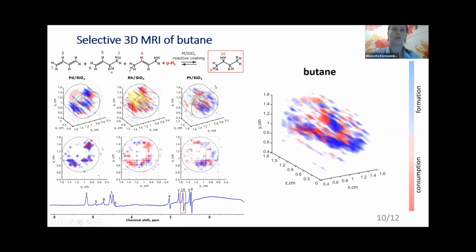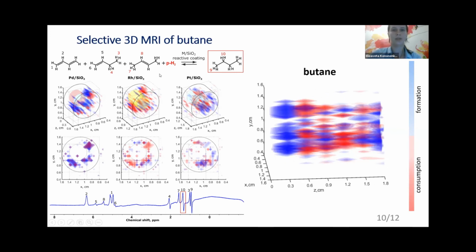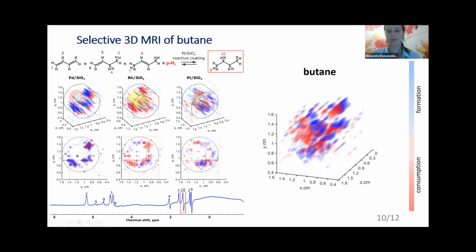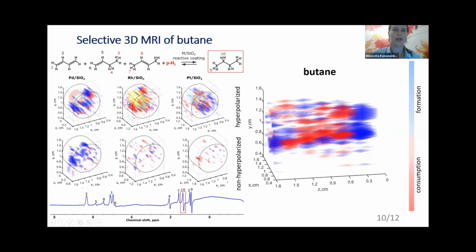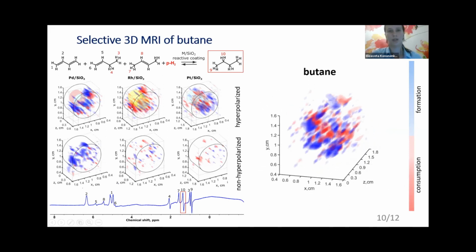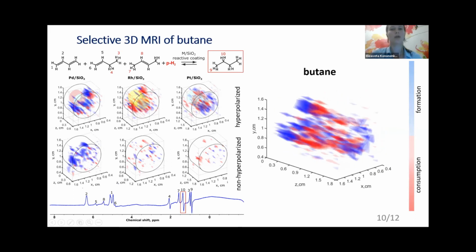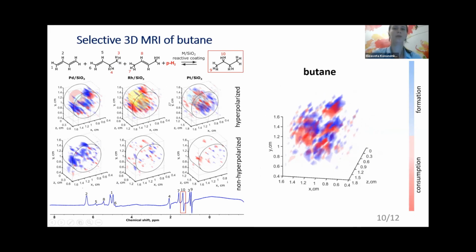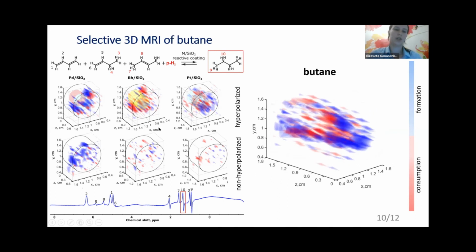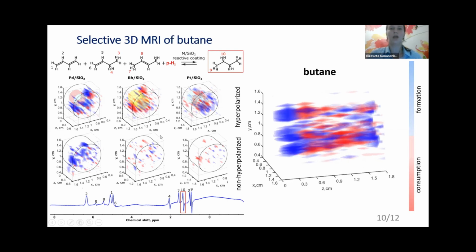This distribution of products indicates a high conversion rate on the palladium catalyst, and also the red region of butane consumption in the rhodium to the silicon oxide catalyst region indicates the relaxation of the hyperpolarized butane formed in the previous layer, which agrees with the results obtained using normal hydrogen.